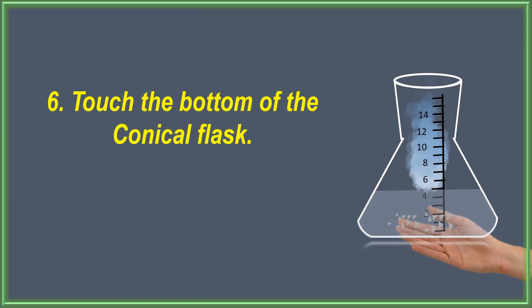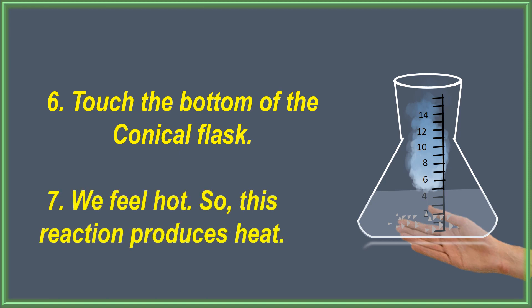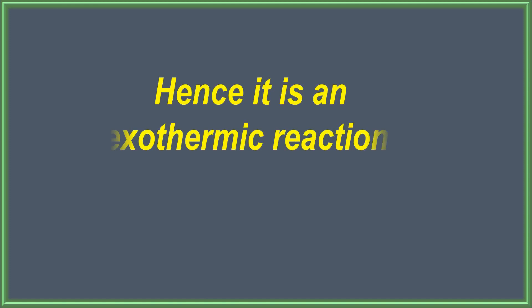Touch the bottom of the conical flask. We feel hot. So this reaction produces heat. Hence, it is an exothermic reaction.